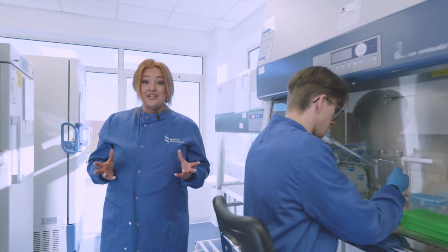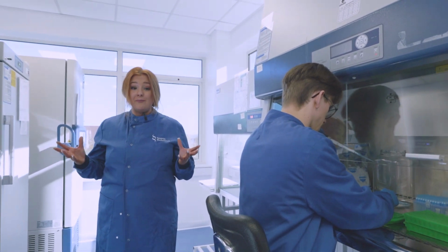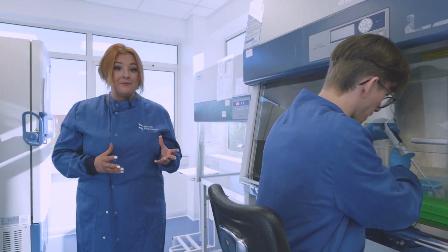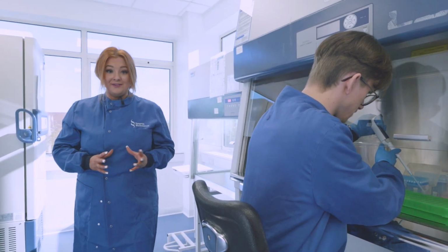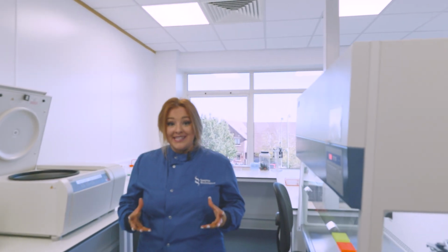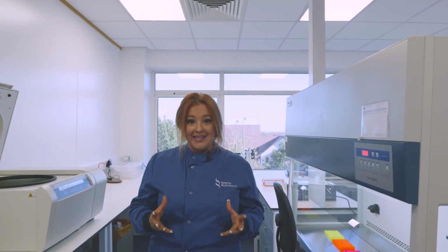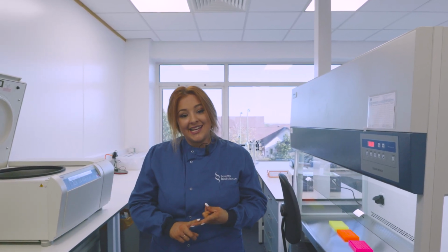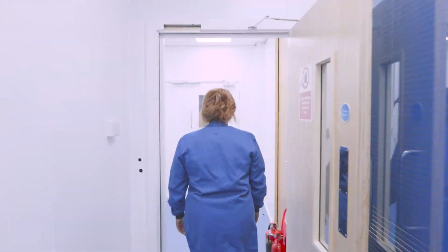So this is our reagent formulation laboratory, and this is where we keep all our reagents. We've got laminar flows to ensure that we have a controlled environment and it's completely clean and sterile. So this is our pre-PCR. This is a fundamental laboratory. This is where our samples and our reagents meet and we set up our reactions in this laboratory. This is critical for our mutation analysis service, our toxicity testing, EndoPredict, and many others. So this is where all the action happens.